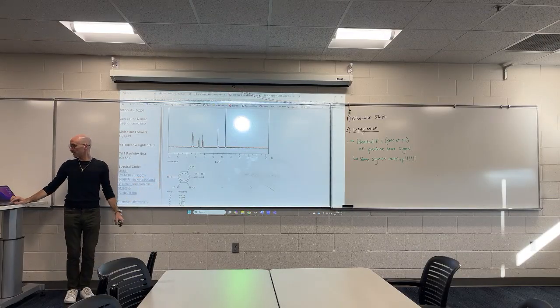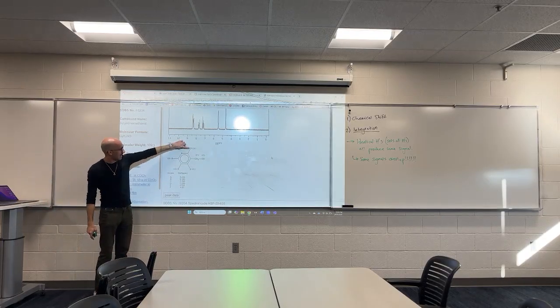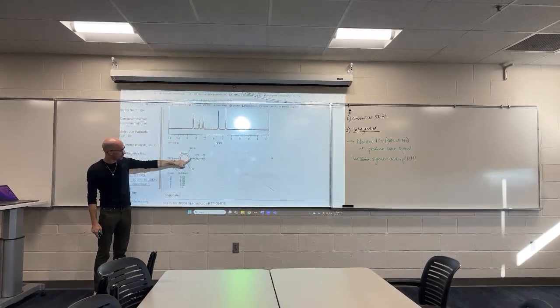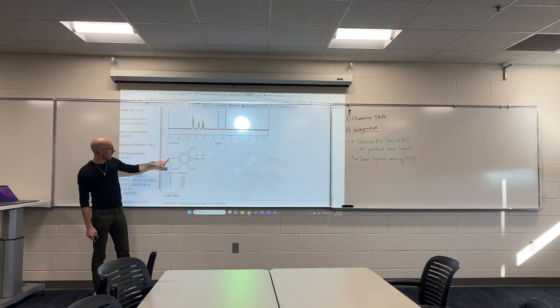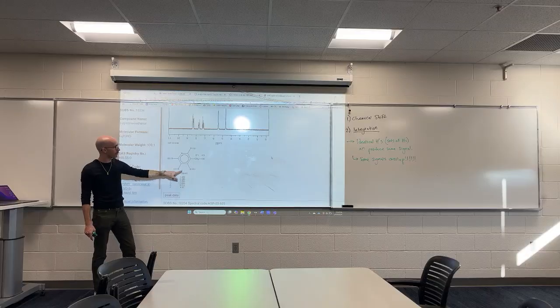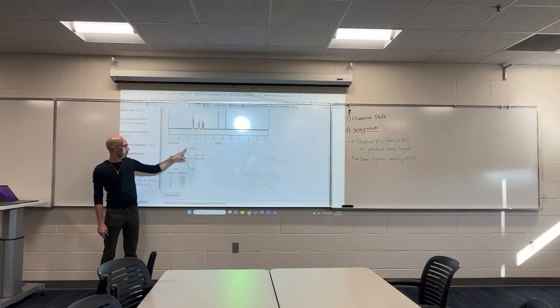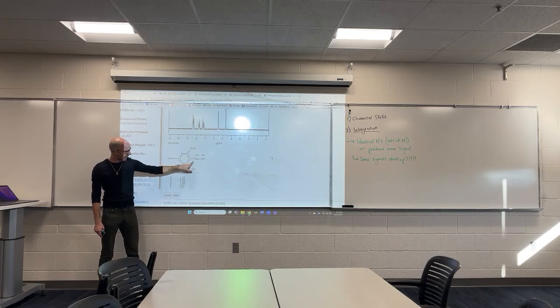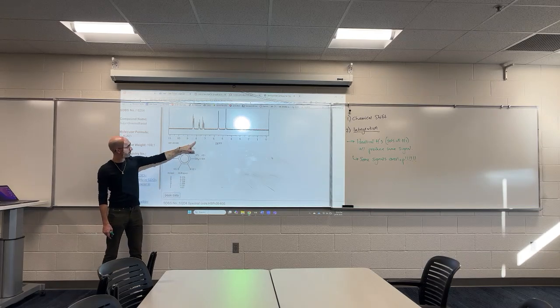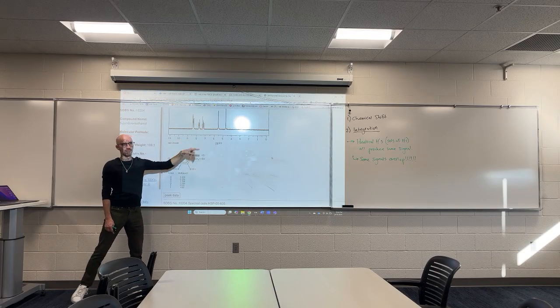And actually, SDBS is really nice, and it tells you this hydrogen at A, next to the nitrogen and the substituent, shows up at 8.4, and this hydrogen at B, next to the nitrogen, 8.3. Those are overlapped. These 2 hydrogens next to the nitrogen. And then hydrogen C, next to the substituent, 7.7. Hydrogen D, in the middle of everything, 7.2.